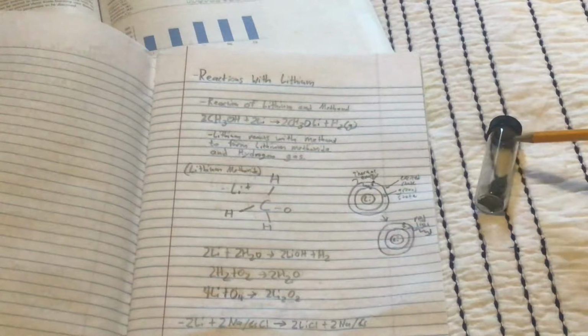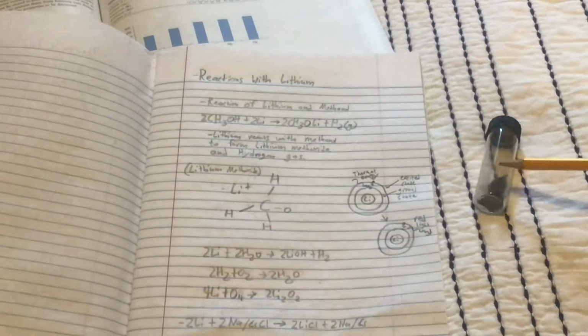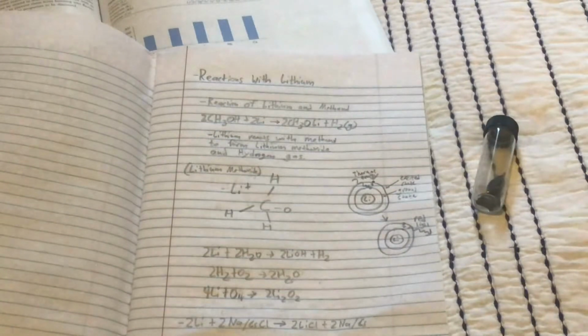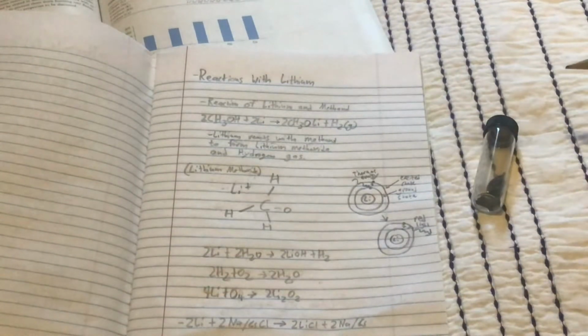So that was pretty cool, reacting lithium with water. But something I noticed was lithium doesn't explode, unlike potassium or sodium or cesium. This is probably because lithium is much more stable than those other elements. But anyways, what else can we do with lithium?